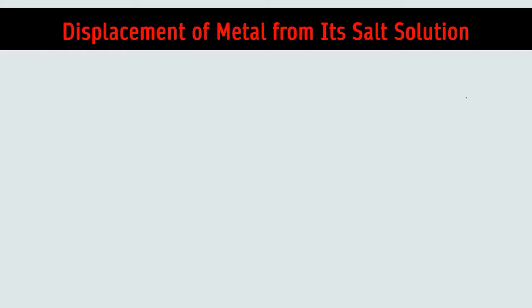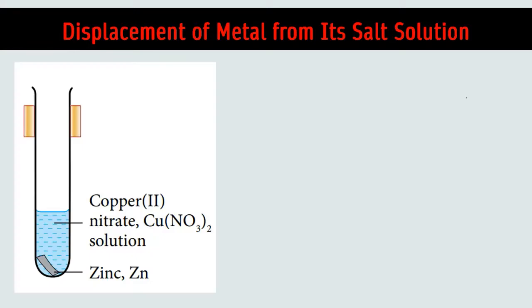Now, let us look at the example of experiment between copper nitrate solution and zinc. In this reaction, zinc metal is more electropositive than copper. I just refer to the electrochemical series that we have mentioned before.